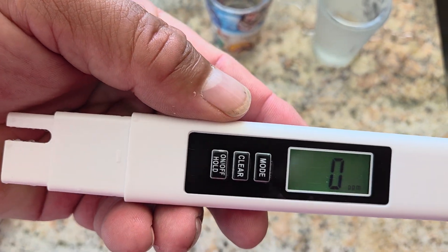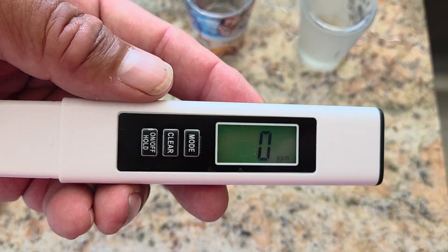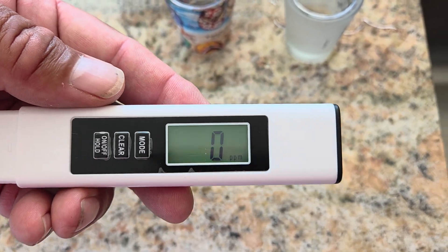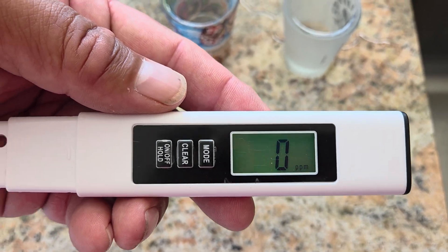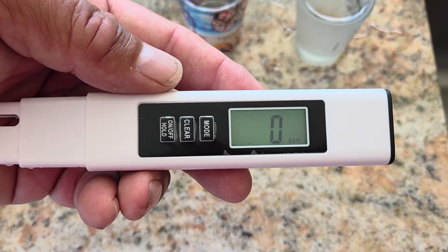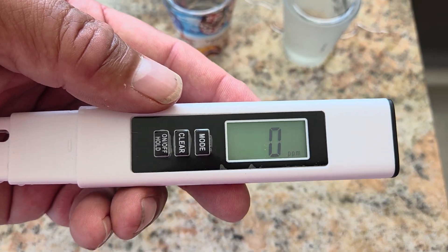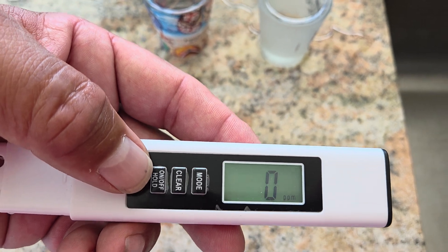This thing has really come in quite handy. It's a nice nifty little gadget. You can test your drinking water from your fridge, you can even test reverse osmosis in some pools, and you can use it to check hardness levels in your aquariums. Makes for a great gift for somebody who likes gadgets. It does have auto turn-off, so if you forget to turn it off, it'll turn off on its own.